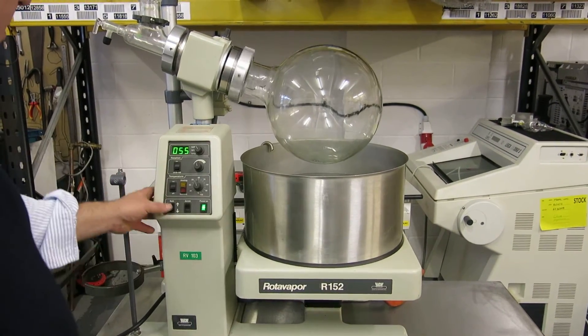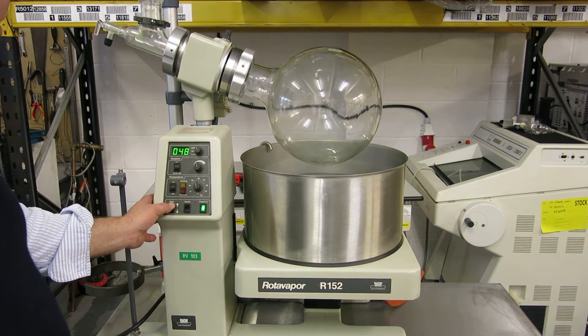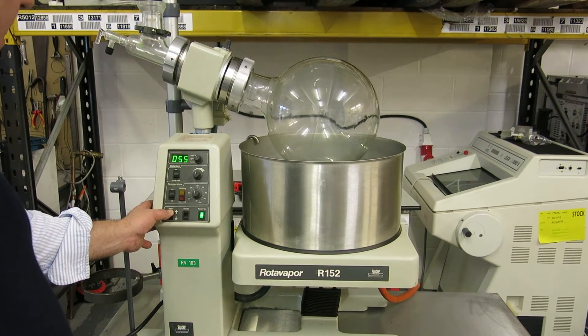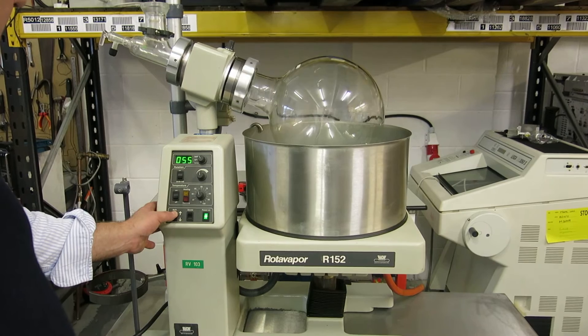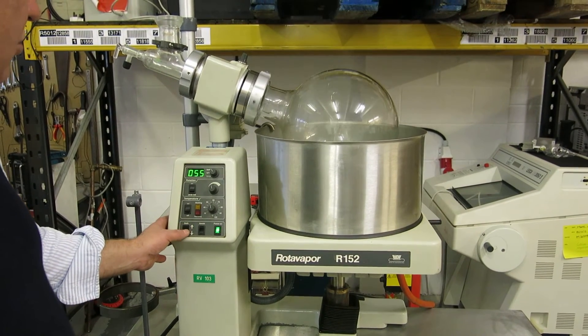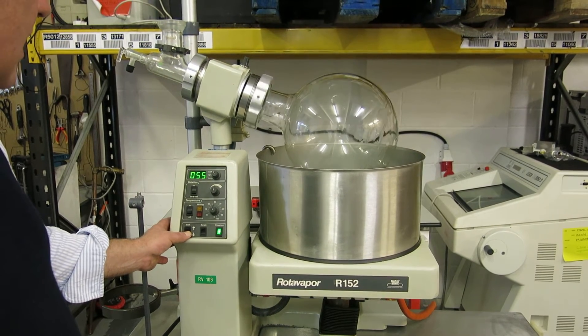The bath has got an automatic higher and lower. If we just go up now you can see that, pushing that button there, it has an automatic stop to prevent it hitting the element. And down.